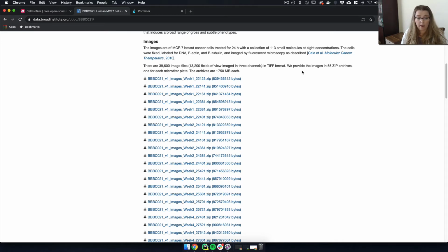So let's say you have an analysis, and that analysis has 4 steps. Each one of those 4 steps takes 15 minutes. That would be an hour if you ran step 1, step 2, step 3, step 4. But what you can start to do is think about how you can parallelize your analyses. How can I take these steps and separate them so that I'm doing everything in a parallel fashion, which means, say, step 2 doesn't depend upon step 1. You can run these in parallel. You can take each one and run it as its own separate analysis.